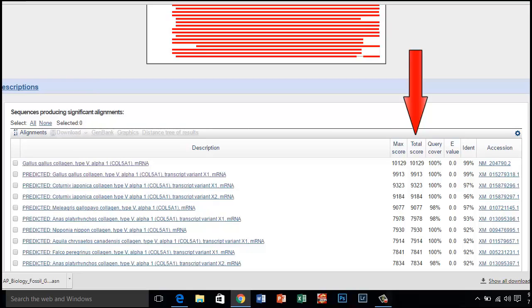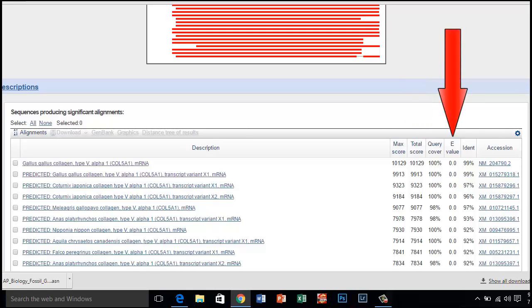The higher the score, the more similar the alignment. The E value is the likelihood that a match occurred purely by chance. The lower the E value, the better the match.